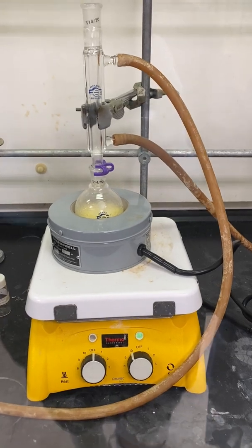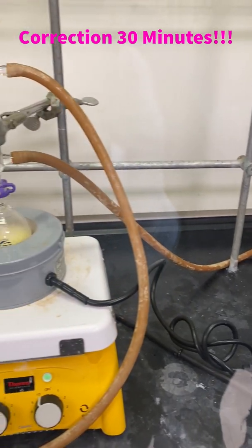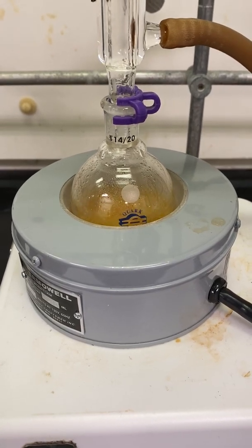Once you have added in everything to your round bottom flask, you are now ready to reflux the reaction for one hour. We should already know how to set up a reflux from the Fischer esterification lab. This is what the reaction should look like when it is refluxing.